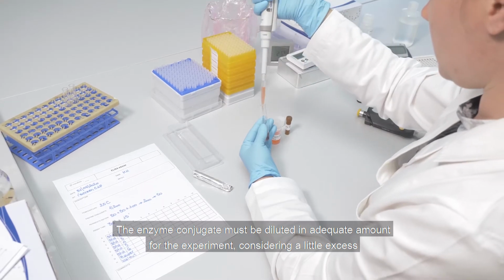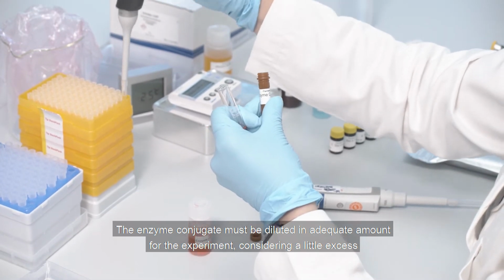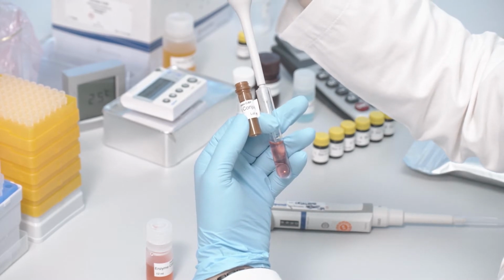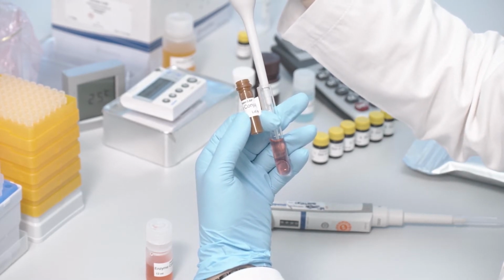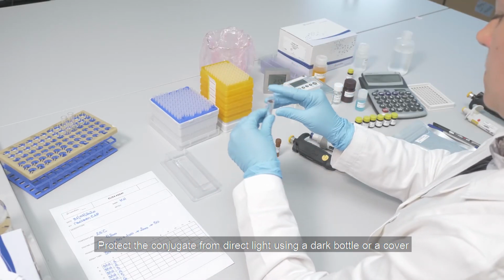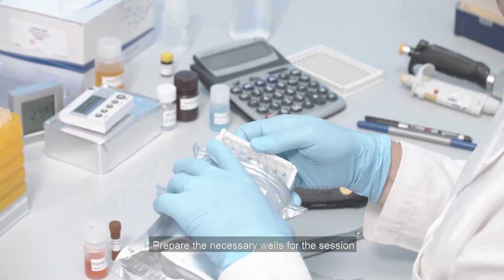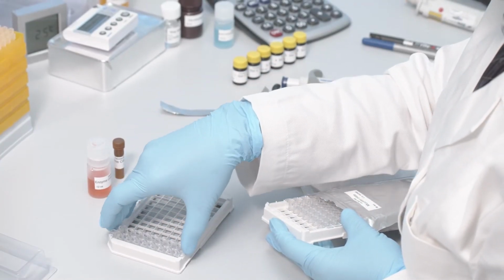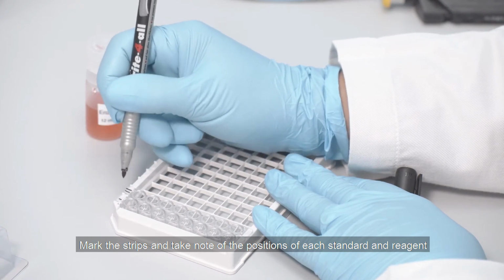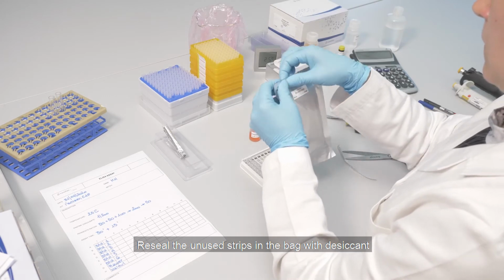The enzyme conjugate must be diluted in adequate amount for the experiment, considering a little excess. Protect the conjugate from direct light using a dark bottle or a cover. Prepare the necessary wells for the session. Mark the strips and take note of the positions of each standard and reagent. Reseal the unused strips in the bag with desiccant.